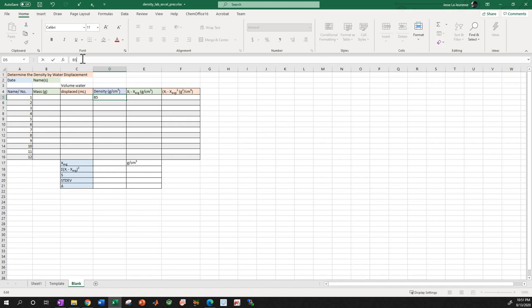divided by, now computers have their own language of math. It's really good to learn it. Learn it now. You're not expected to just know it, but over time, throughout your undergrad education, you'll obtain this information. Well, it's that. It's /. That's divide. So B5 divided by C5. Sorry, I know, just yelling out numbers and letters, it can be boring.